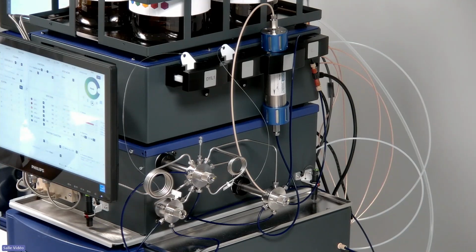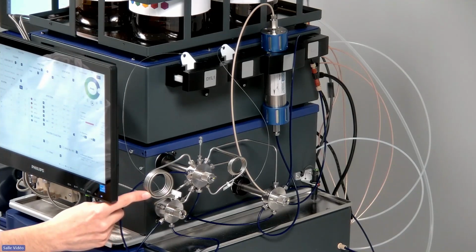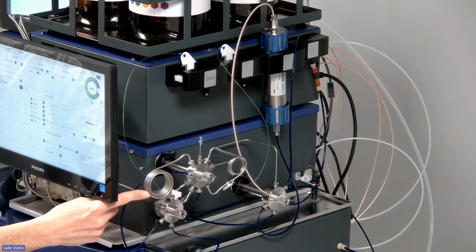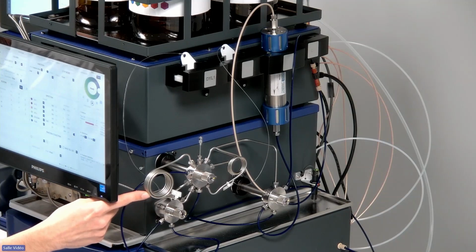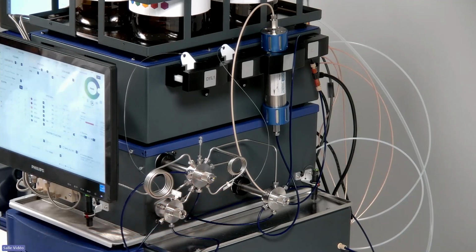On this valve, you can put two loops. Loop number 1 here will be dedicated to column holder number 1, and the loop number 2 will be dedicated to column 2 and 3. That means you can work on this system with two different sizes of columns and adapt the volume of the loop and so the quantity injected for each one.